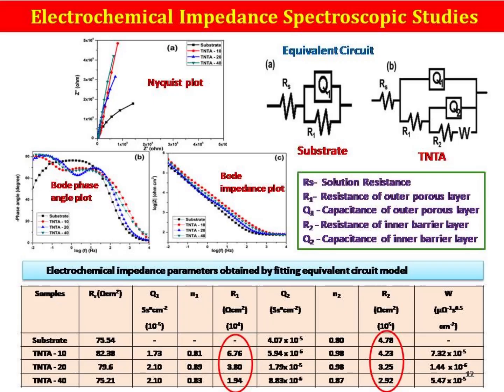The table shows different parameters like solution resistance, then R1, R2 and Warburg impedance, etc.